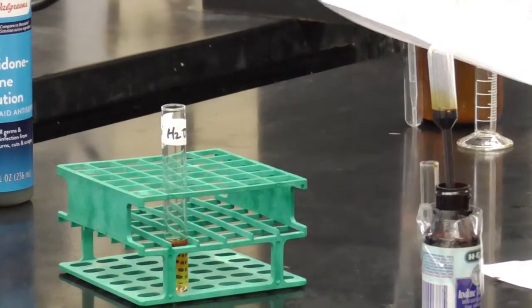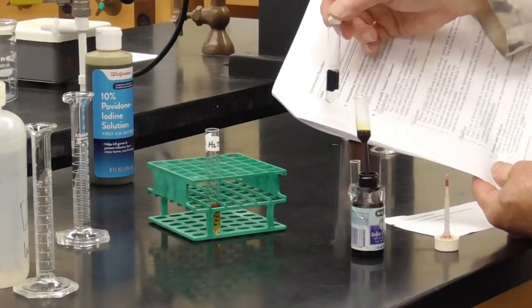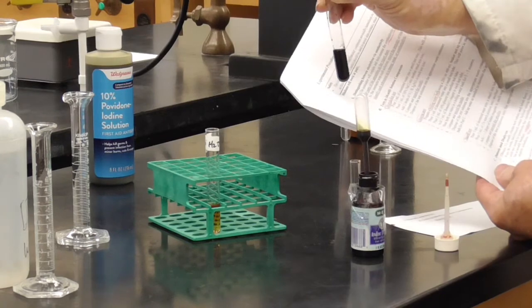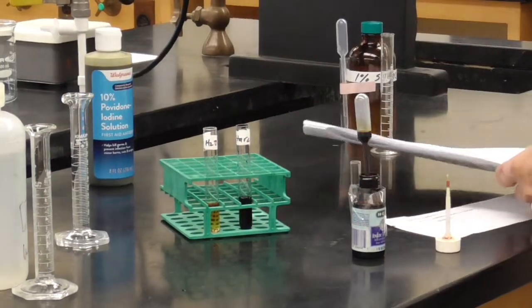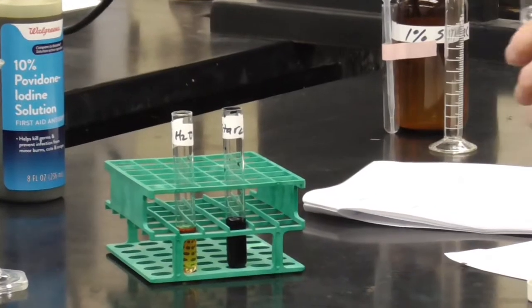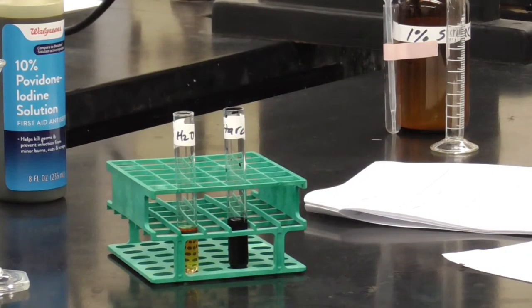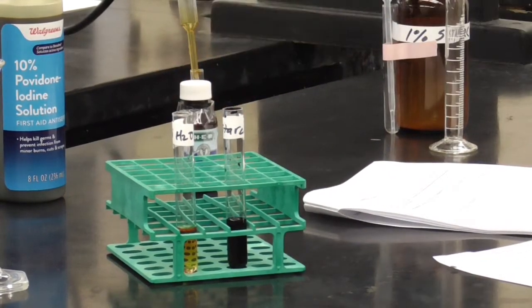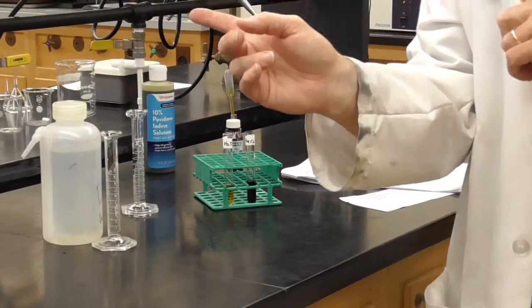Ooh, very different result there, right? You get a very dark purple, and if I mix it together like that, you can see the whole thing there. Very dark purple. So again, a negative versus a positive control, we can clearly see that it's a great qualitative test for starch. All right, so these 3 tests are now going to be used in part C in dialysis and osmosis.